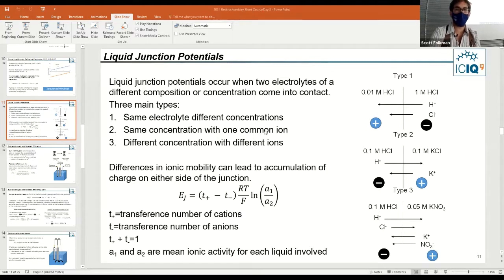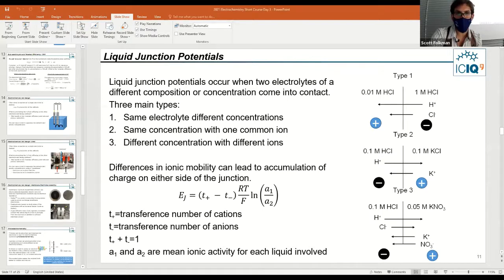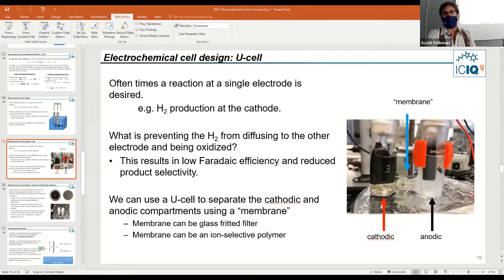Okay, so the question first was, in an example, can the working electrode be used as an anode and a cathode? And the second question was, in some papers, the audience member noticed that authors often describe only using a 2 electrode setup. So the answer to the first question is the working electrode can be used both as an anode or a cathode depending on the potential applied.